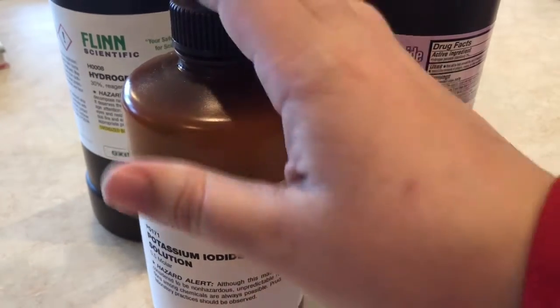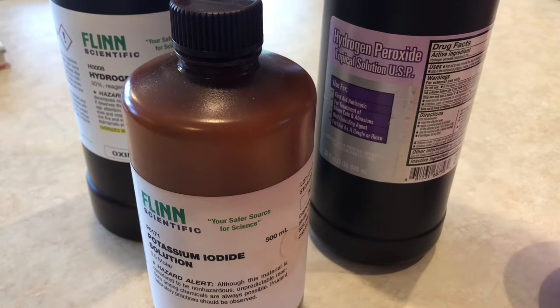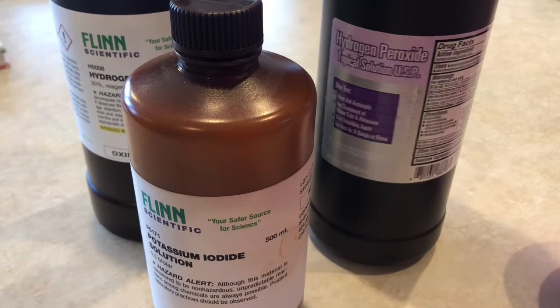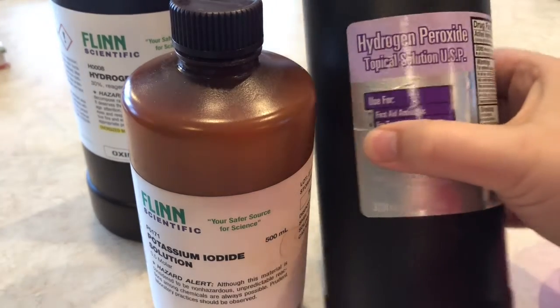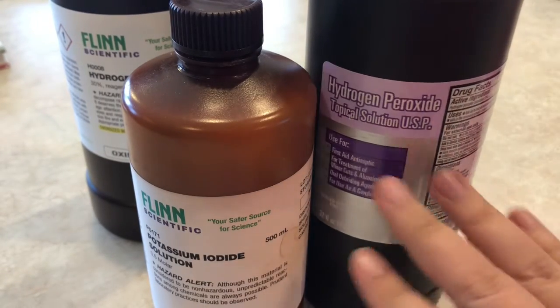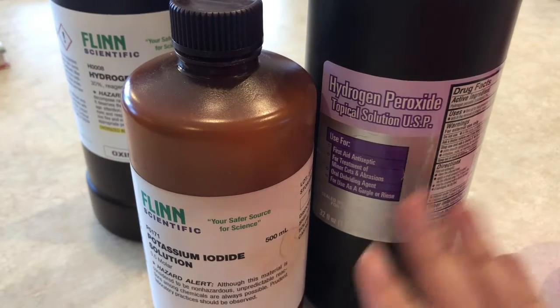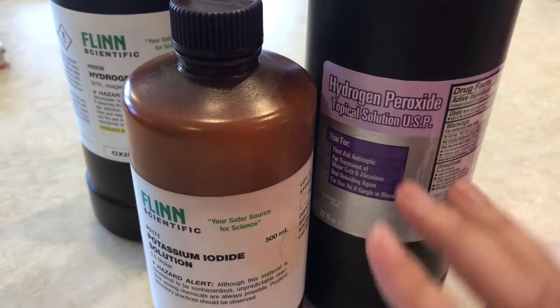The reaction that's happening is the breakdown of hydrogen peroxide into water and oxygen gas. Hydrogen peroxide, you guys know by now, is H2O2. And when you let hydrogen peroxide sit, it just naturally turns into water, and then the oxygen gas escapes.